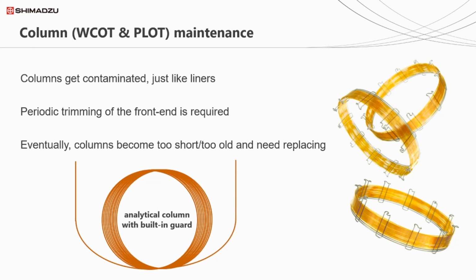It's actually possible to purchase some columns with guard columns built in, removing the need for the additional column connections to join the analytical and guard columns together. These are popular in applications where samples are very dirty, such as clinical labs where urine and whole blood are analysed.